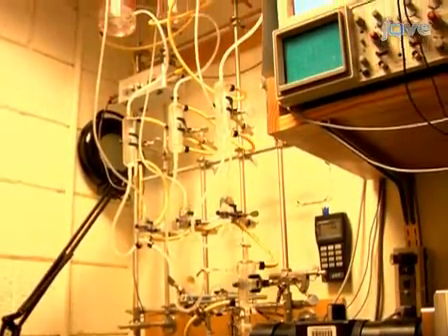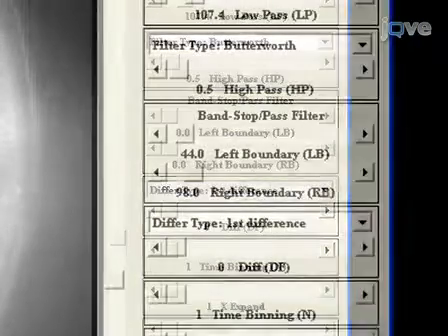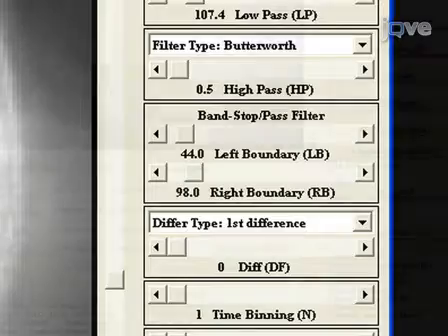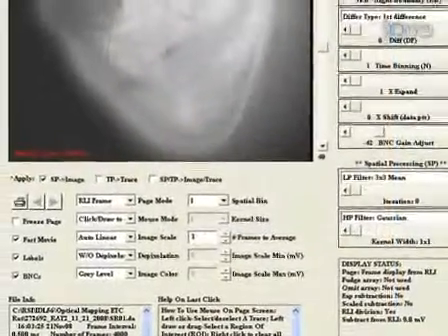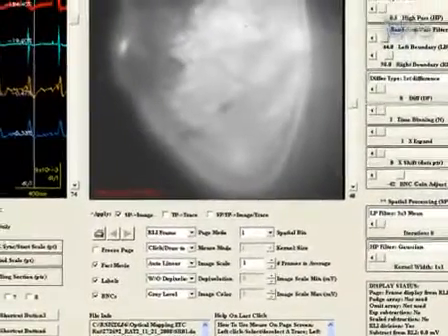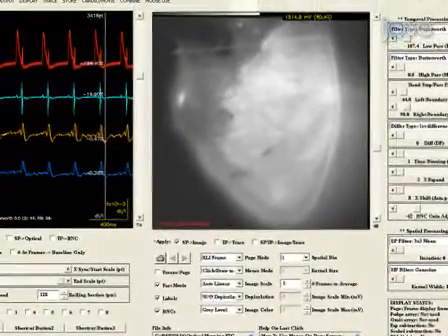Following acquisition, process the data using different filter settings. The default settings are generally used, except when adjusting the band-stop filter, which is set with the left boundary at 44.0 and the right boundary at 98.0. Afterward, the recorded information is processed and used to generate a movie. Data from one acquisition corresponds to the local electrical activation at 16,384 sites on the heart surface over a period of 2 seconds.